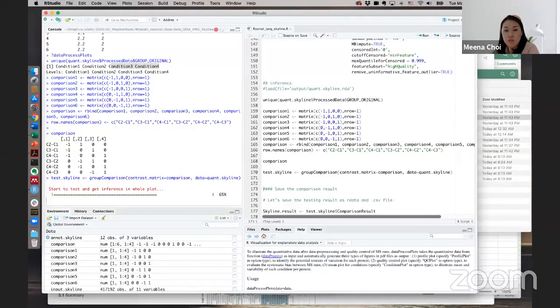However, we just report it as it is. We cannot calculate the standard error, so NA. We cannot calculate the degrees of freedom, so NA. We cannot calculate the p-value, so NA, or we just mark the p-value as zero. After this, I will show you that we also have some extra columns: an issue column and a comment.